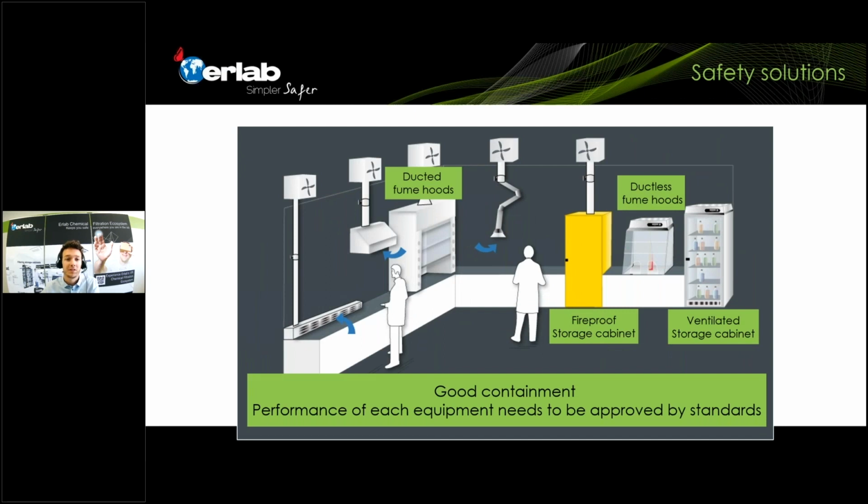This is another lab, but this is a lab equipped with different fume hoods or different ventilated enclosures, which make sure that you have that air barrier. So it's really a question of asking yourselves, this is a risk we are exposed to, and what's the good solution that we need? And in most cases, it's just making sure that there is a barrier that's not visible, unfortunately, between the people in the lab and the risks that you're exposed to.